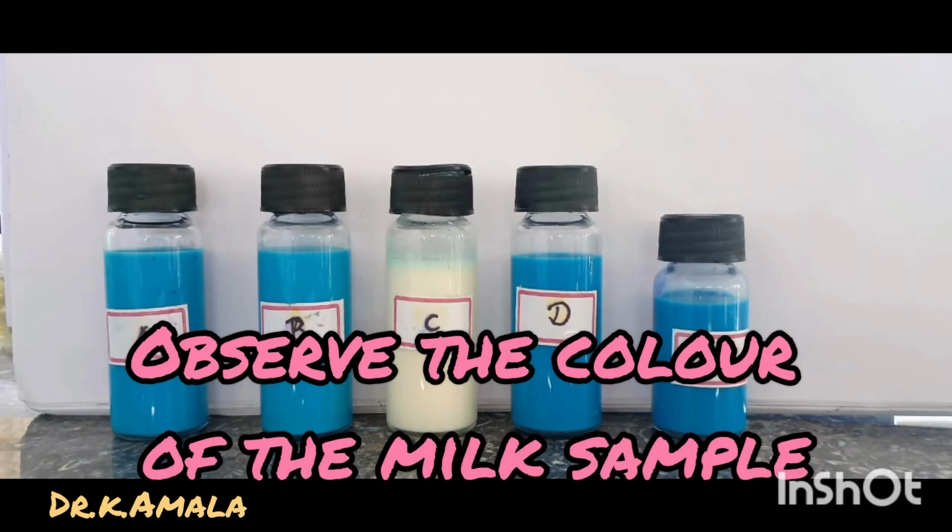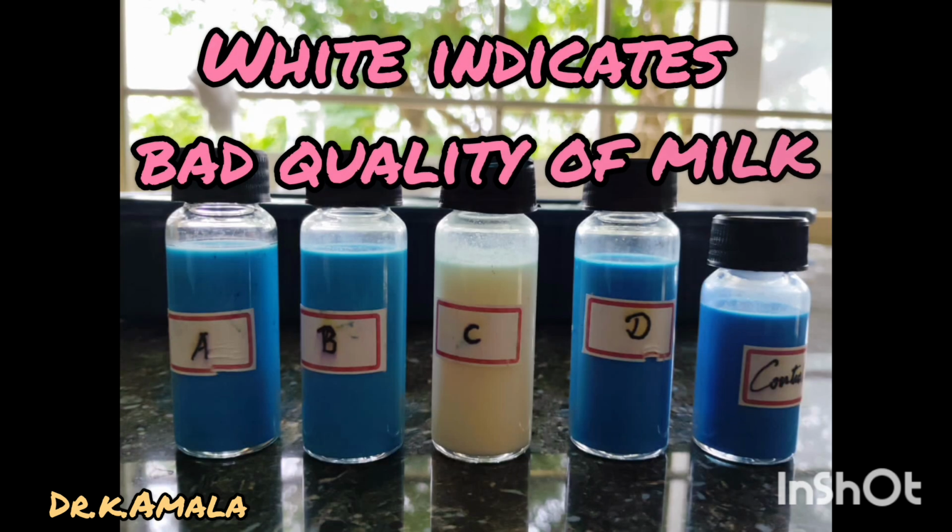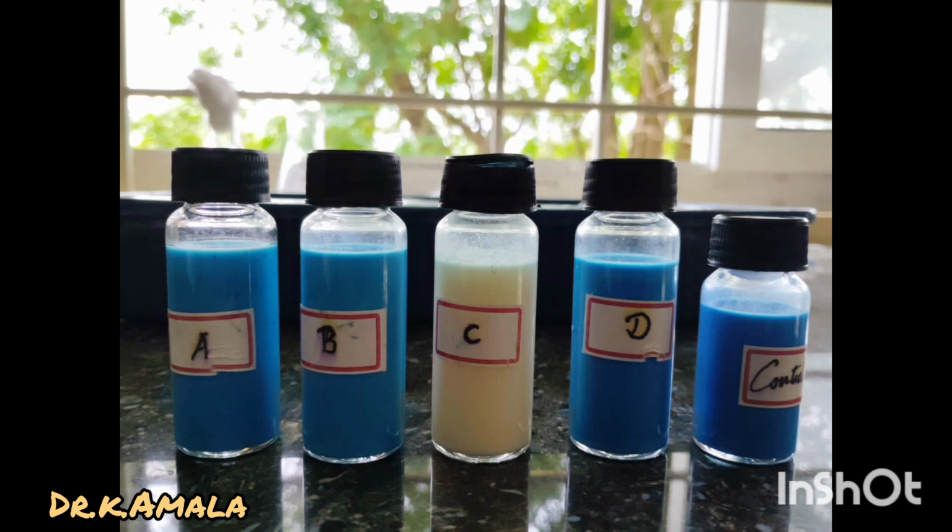After 30 minutes, observe the color of the milk solution. Blue color indicates good quality of milk. Colorless or pale blue indicates poor quality of milk. Record the time taken for the color change. Compare the result with the standard chart to determine the bacterial count.